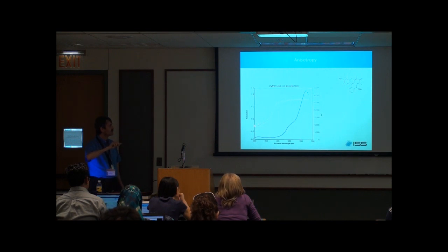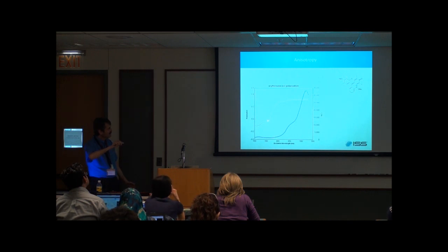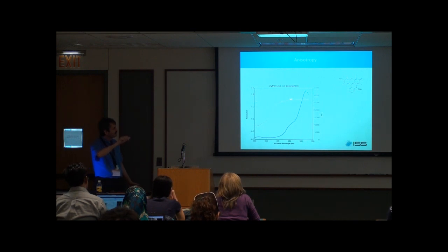You see that it starts at minus 0.1 at these wavelengths. So most likely here we are probing levels higher than S1, the first excited level. And then the polarization tapers off to a value close to 0.3 and stays there throughout.